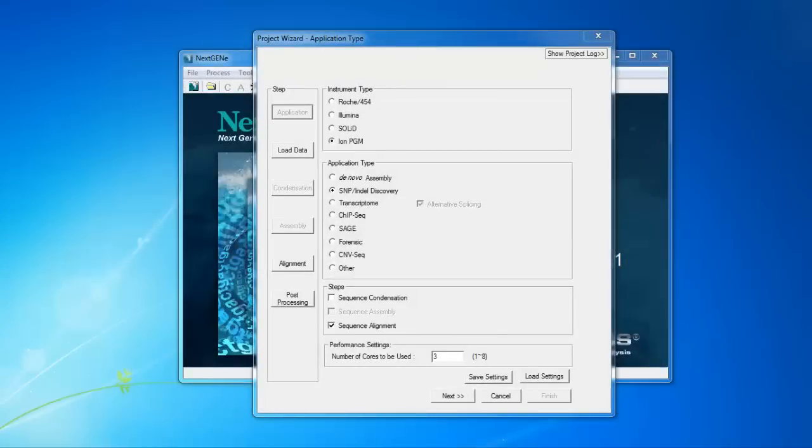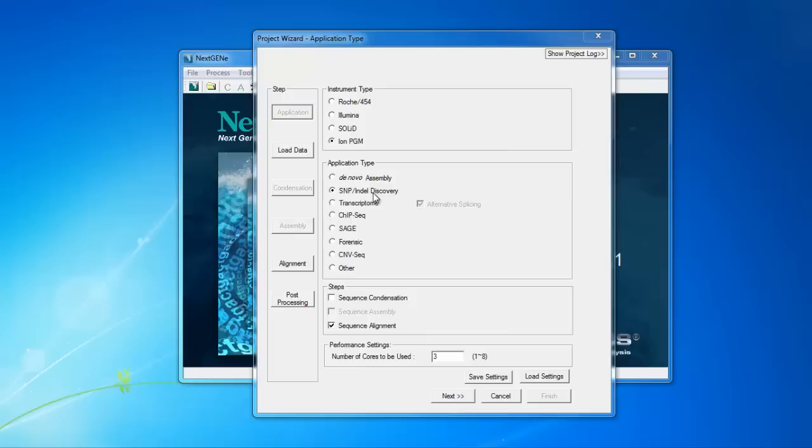Setting up the analysis for your AmpliSeq data with NextGene is pretty straightforward. On the first page, we simply select the instrument type, Ion PGM, the application type, SNP and Indel Discovery, and under Steps, Sequence Alignment. Then click Next.